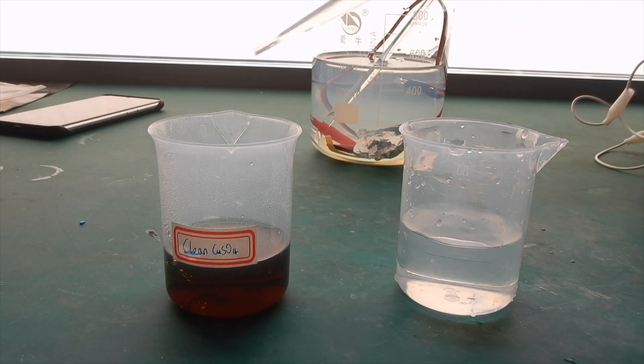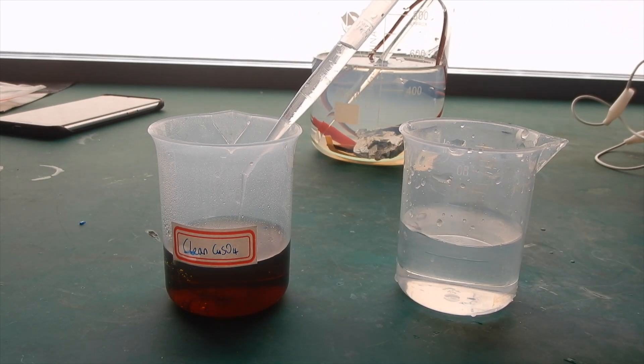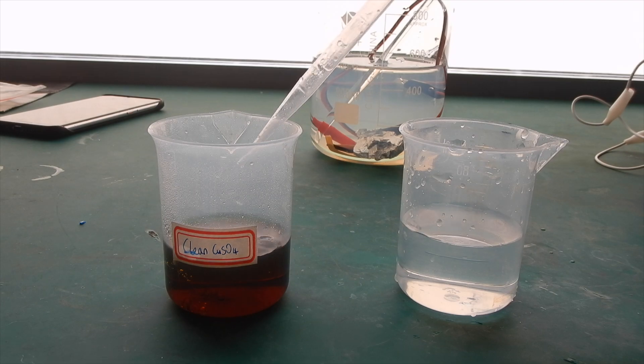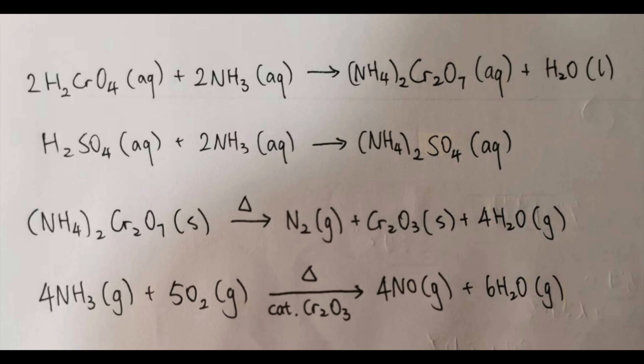I carefully added ammonia dropwise to the chromic acid solution, and kept checking the pH until it reaches 3 to 4. Obviously, the pH papers were disposed in the thiosulfate. Here, I am neutralizing the acid in the solution, which are chromic acid and sulfuric acid, with ammonia, to produce the ammonium salts.